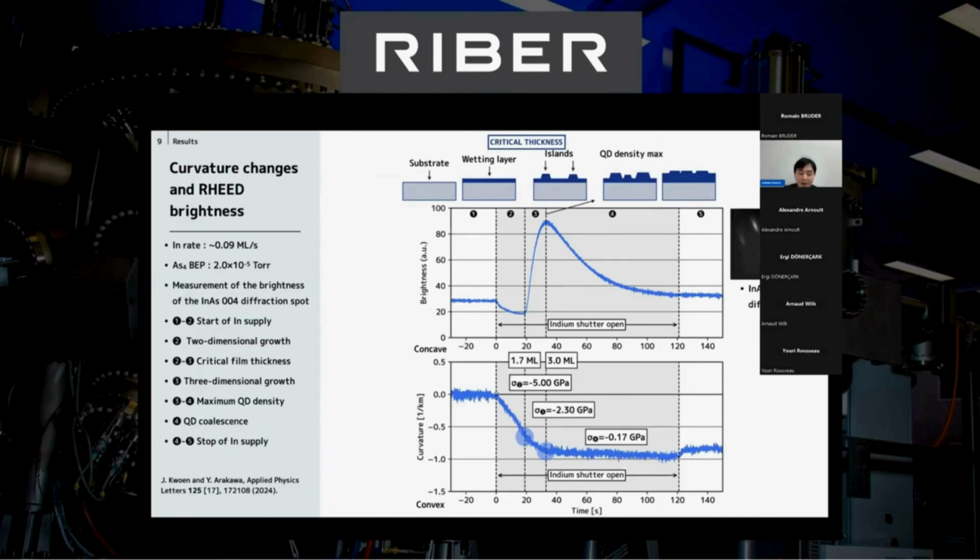At this stage, a decrease in the overall brightness of the RHEED pattern region can be observed, which is attributed to the darkening of the gallium arsenide centered 4x4 patterns as indium arsenide grows.